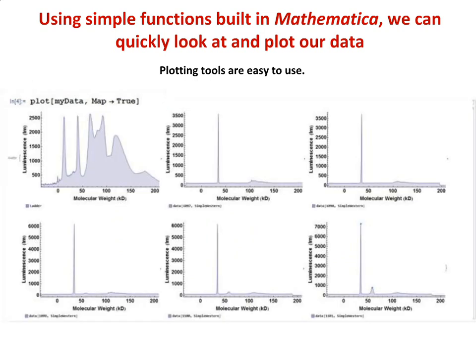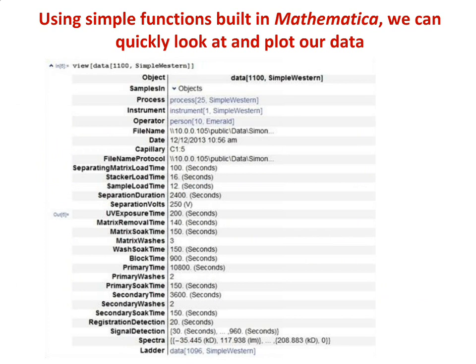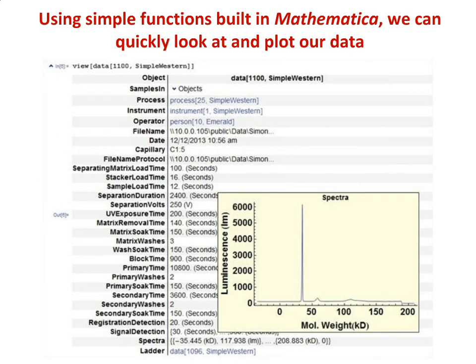Again, I can go in and view all of the information that is associated with one of these data objects. So I just picked one that we see has the two peaks, both GAPDH and cleaved PARP. In this data object, we store all of the information from the Wes software, all of the particular parameters that were used during the actual run. So if we wanted to repeat this exactly as is, we have all of this information stored in actually several places. Even if I mouse over some of the information here, like the raw spectra stored in this data object, it'll pop up in a little window and I can see the plot there.